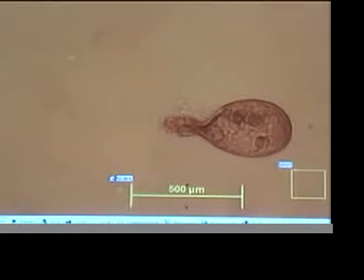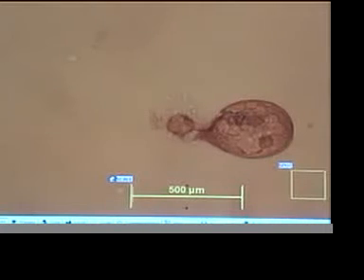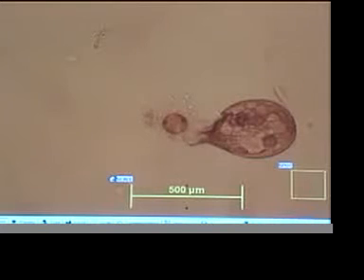Okay, we have another one, a little neighbor of the last one. This is happening in real time. Devitalization of a living Blepharisma, happening in kind of slow motion.